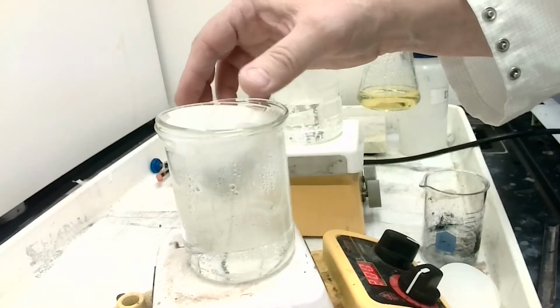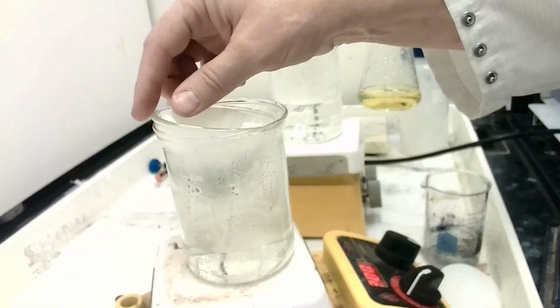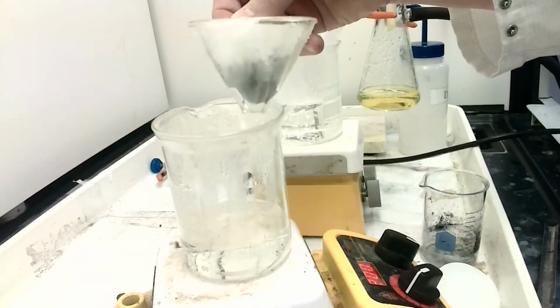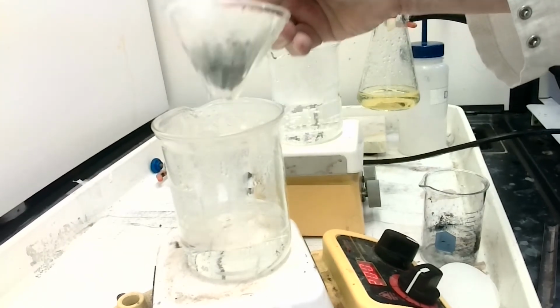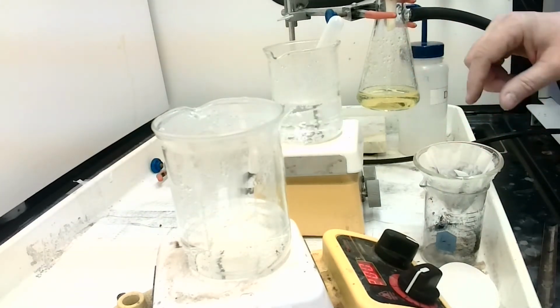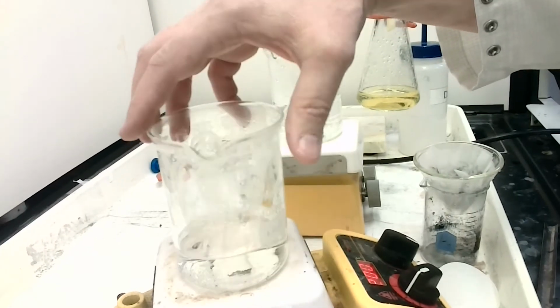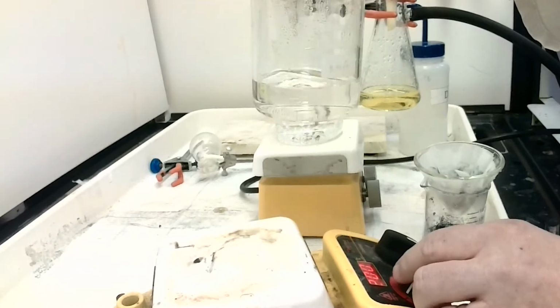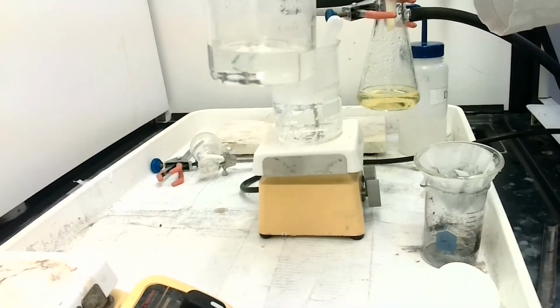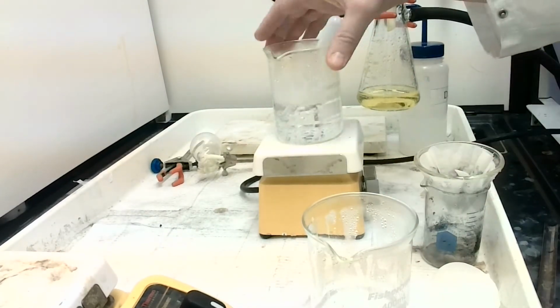So yeah, I'm seeing some precipitate at the bottom there. Is it already precipitating? That's a good sign. That's what we want to see. I'm not showing you my camera though, but I'm seeing it from here. It's getting murky. Okay, I think we're done filtering. We're going to let that cool. We'll spread that out on a paper towel later. Doesn't matter because we want it to form crystals now. Oh no, that was just the light. Never mind. Okay, so now it's just a matter of letting it cool. Turn off all our heat sources.